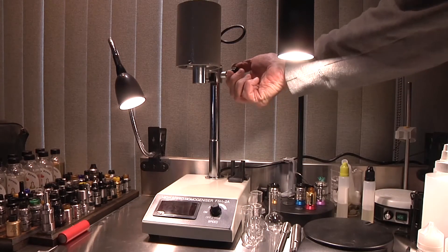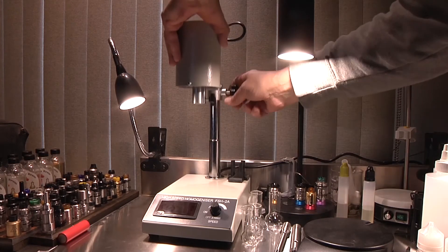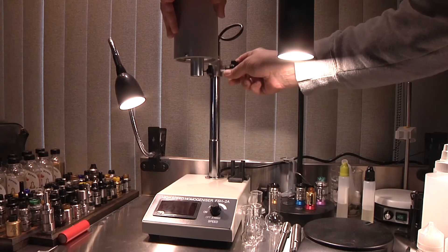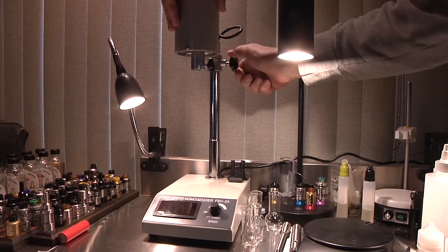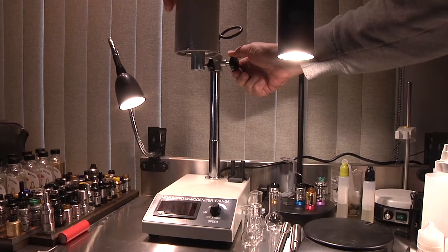Over here we have a knob that we can loosen, and that will allow us to adjust the motor up and down. It is a little floppy while you're adjusting it, so it's a good idea to do it carefully — and obviously two hands, because it will just free fall.